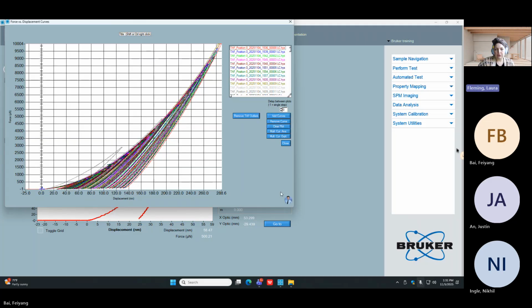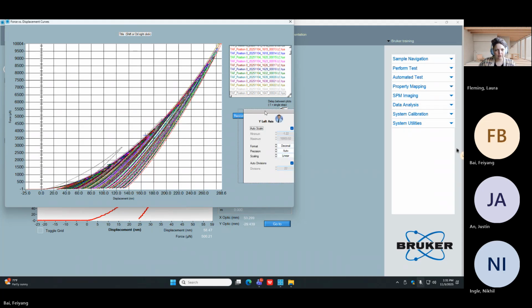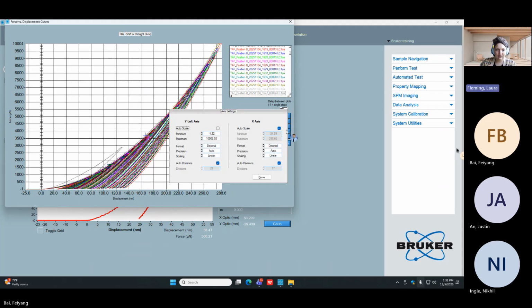So overall, really nice. We still have that one outlier, so that outlier wasn't due to re-zeroing, but we can double check by zooming in a little bit more. So go ahead and double click in the center. And let's go -5 to 5 and -5 to 5.